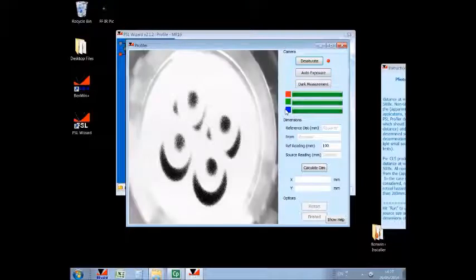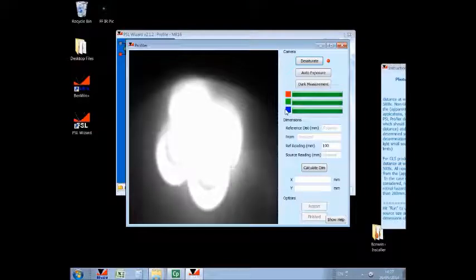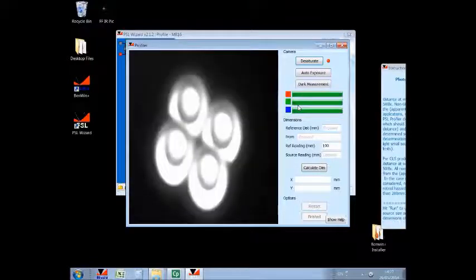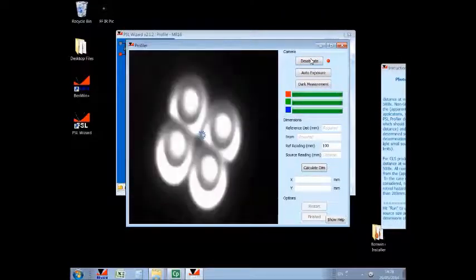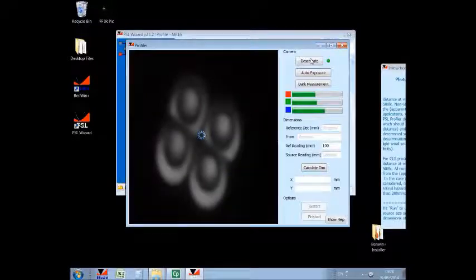Then we will proceed to increase the ND filtering, first pushing the ND filter wheel down, so ND3 and ND4 still in saturation as indicated by the red light and the RGB bars, and still in saturation. We can try the next range down and we are well within level. We could try the previous range and try to desaturate to see what would result. It's always better to have as much signal as possible rather than being toward the noise floor of the camera.